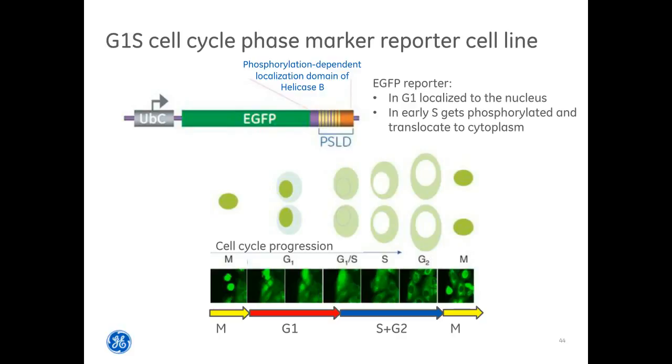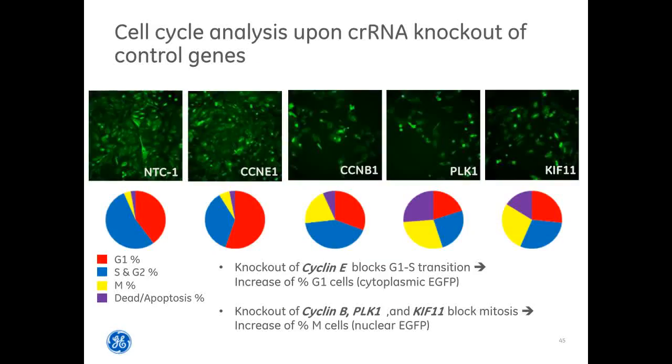So this is a really good example of an assay that absolutely requires a 1 well per gene format that can interrogate genes, in this case, that may play a role in this aspect of cell cycle progression. So we're still doing our assay validation, but here are some really nice results with, again, our positive control genes. So note that rather than showing you 4 CRISPRs per gene, I'm showing you 1 CRISPR for each of 4 different positive control genes.